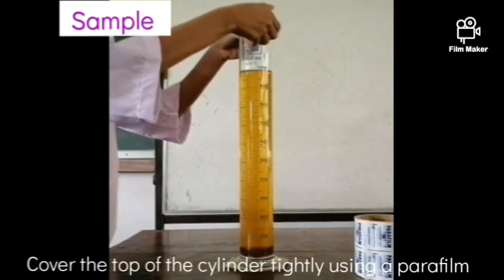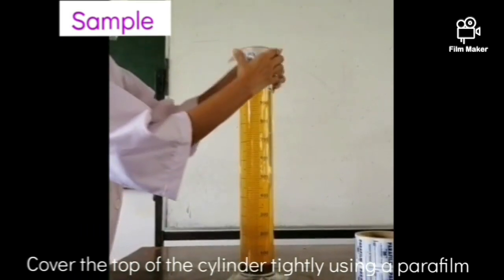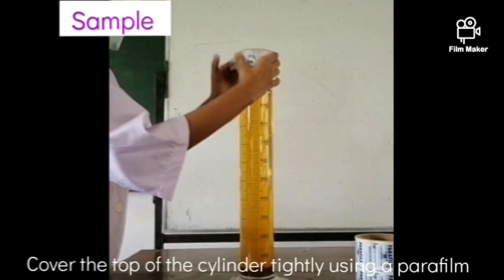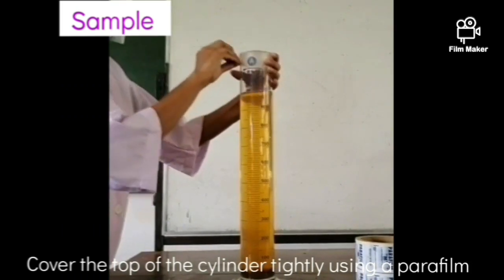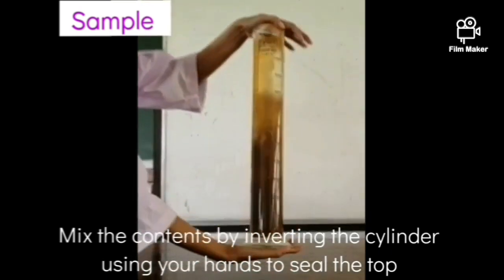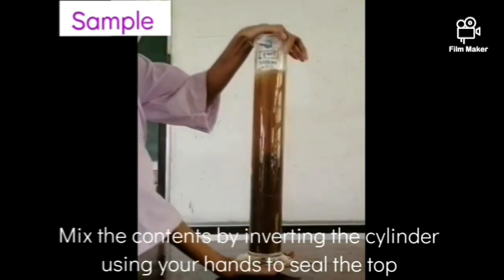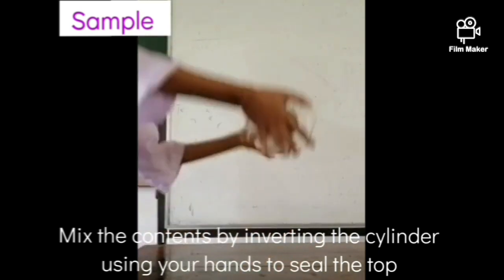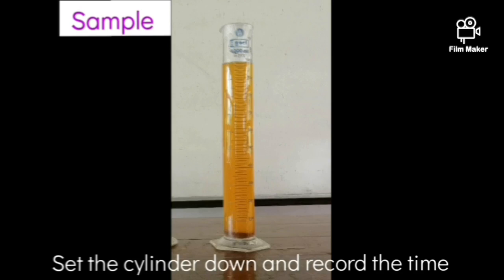Next, cover the opening of the cylinder using a parafilm and mix the solution in the cylinder by inverting it. We follow this process to give the same settling time to all the particles in the solution. When all the soil material is suspended again, let the solution settle and start recording the time.